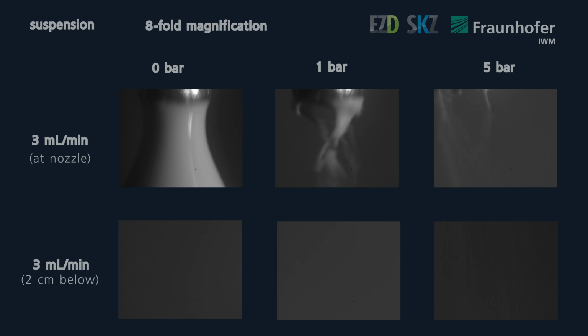Despite the ultra-bright light source, the images appear dark due to the camera's high shutter speed. The videos you see here have been brightened using software.